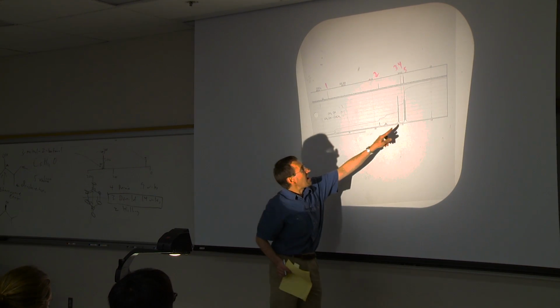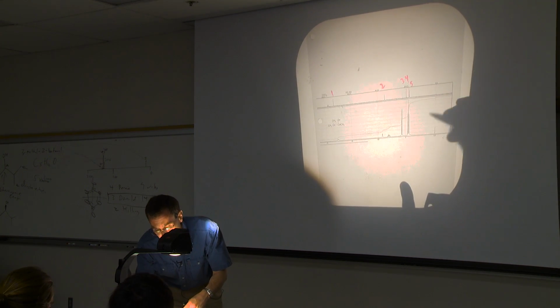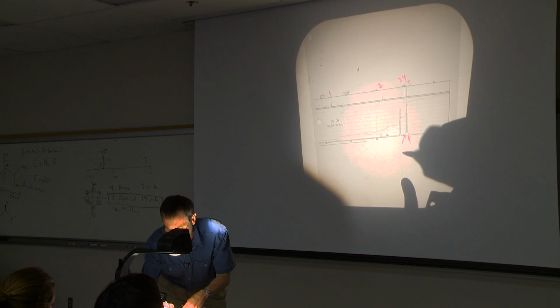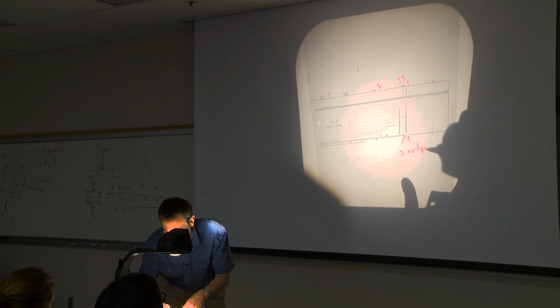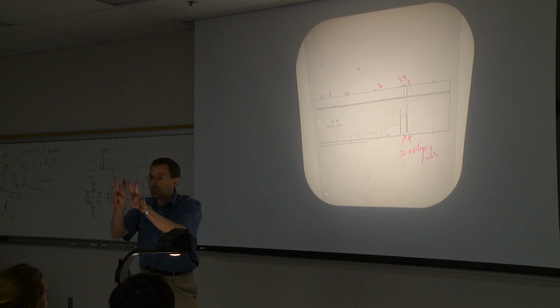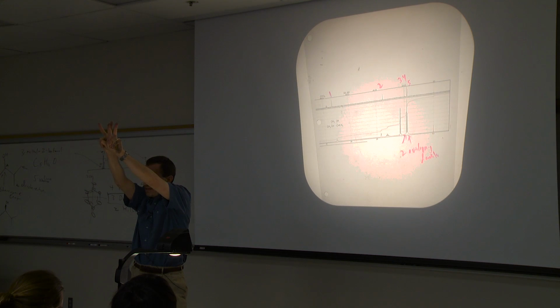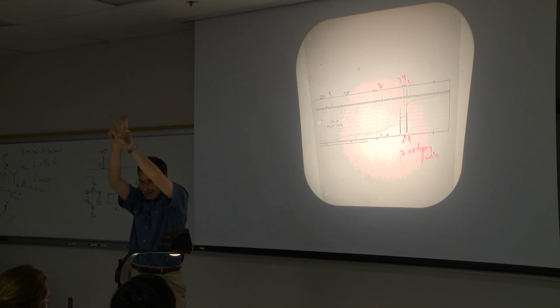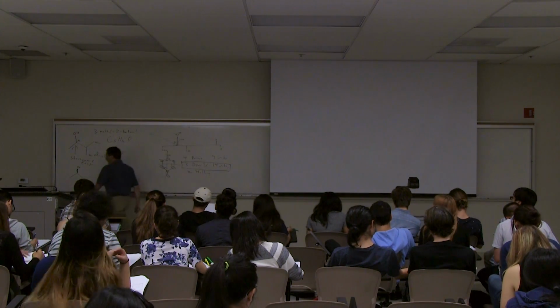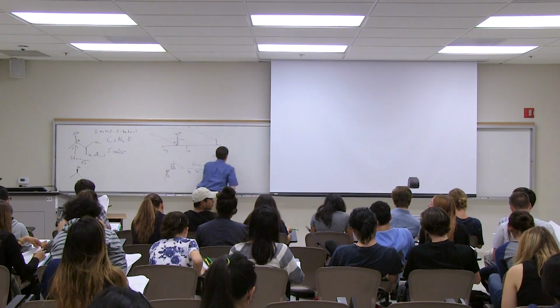I should also point out to you that what looks like a triplet here from the methyl groups is actually 2 overlapping doublets. In other words, those methyl groups, you see them as diastereotopic in the proton NMR as well. They each give doublets, but if those doublets happen to be very near to each other, they look like a triplet.